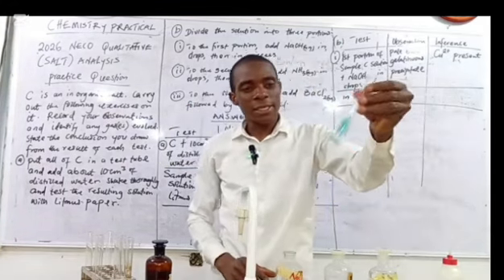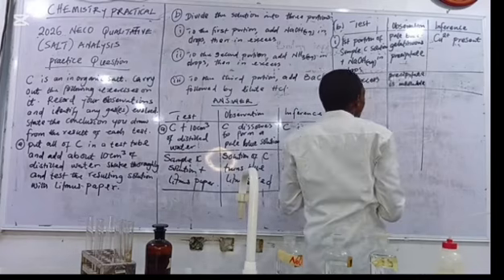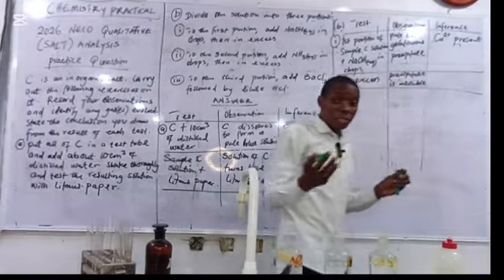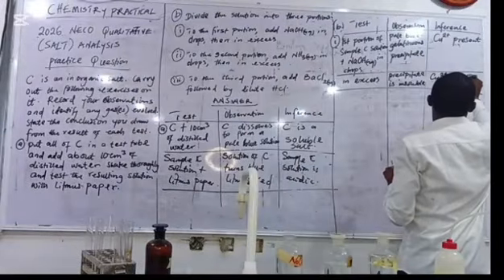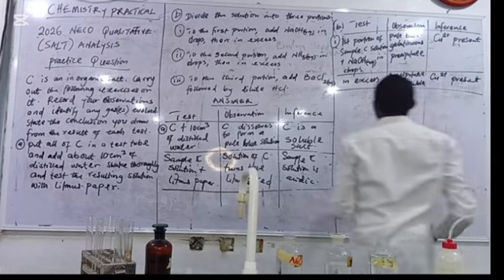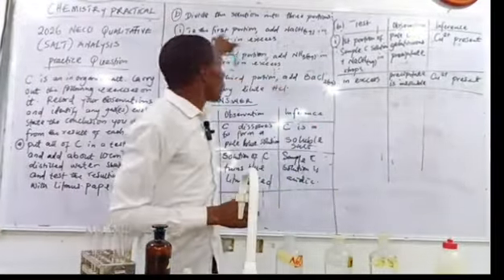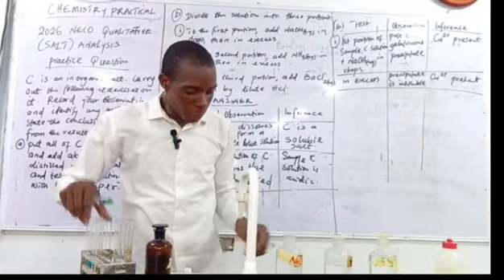So in excess is still pale blue, right? Precipitate is not soluble, or we say precipitate does not dissolve. Cu2 plus is present there. We are done with the first question under option B. Go to the second portion.